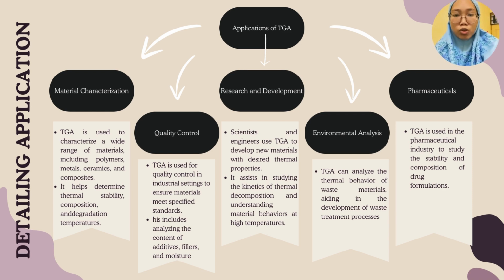The second point is quality control. TGA is used for quality control in industrial settings to ensure material meets specified standards. Cases include analyzing the content of additives, fillers and moisture.